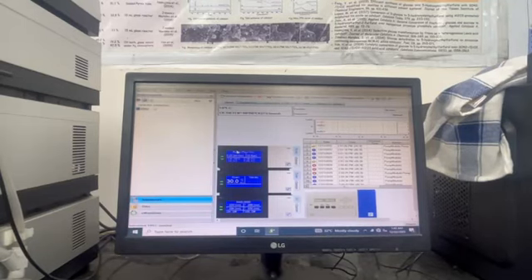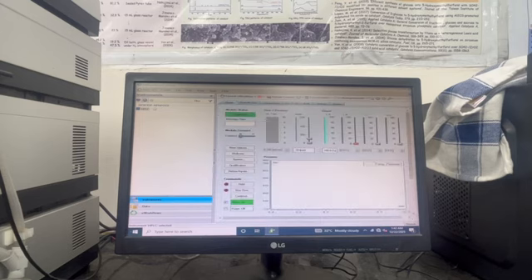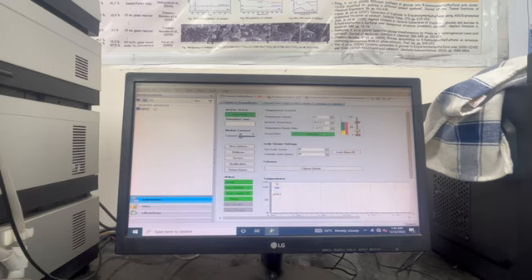So to start analysis, like I mentioned in the previous video, we have to make sure everything is in connection, everything is placed. So home is there, then on the pump the flow rate is already 0.2, so for analysis, for demo purpose, it's fine. Then the column, like I said, we can make it 30, 40, 50, anything based on our program.